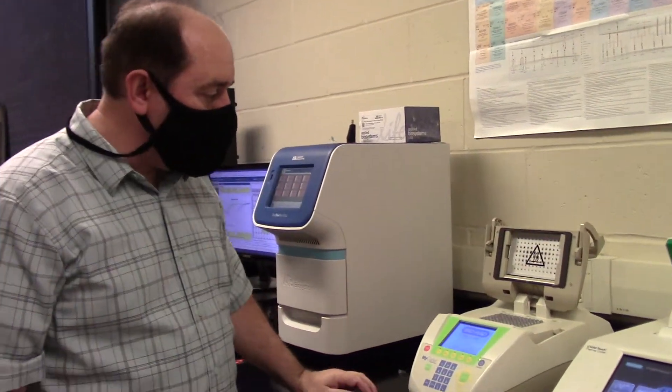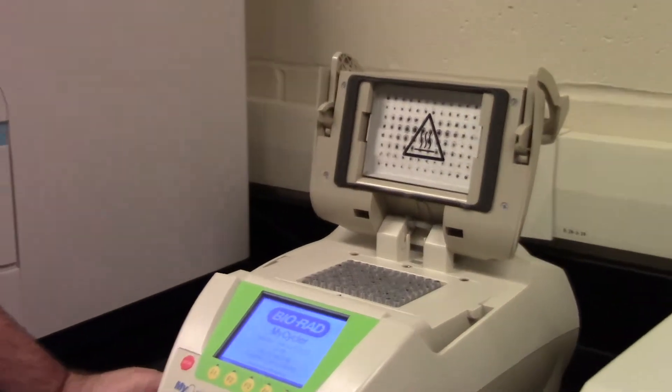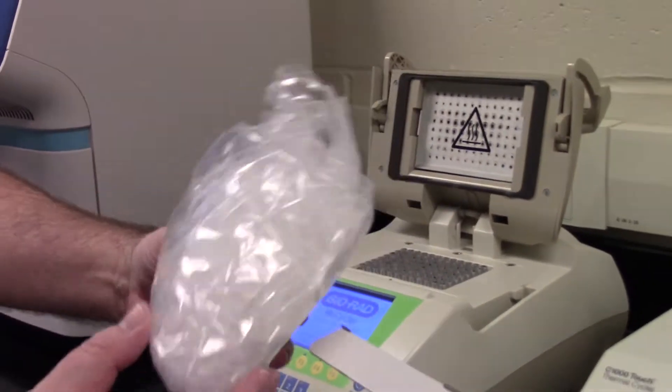Let's look and see what inside the PCR machine looks like. There are many little holes for tubes that will contain 25 microliters each. These are 25 microliter tubes.